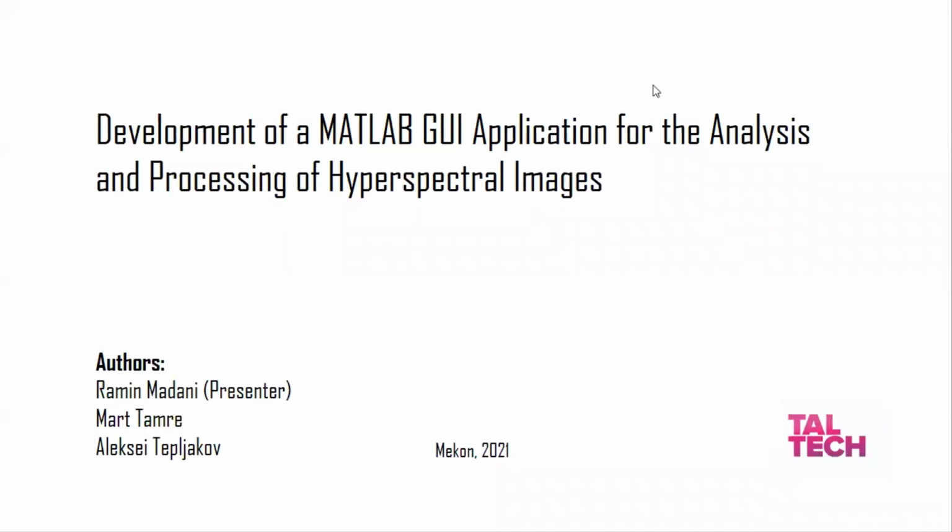Hello everyone, this is Ramin Madani presenting our MATLAB GUI application, which is dedicated to the analysis and processing of hyperspectral images. Our group consists of Dr. Mart, Dr. Aleksei Tepljakov, and myself. We're all from Tallinn University of Technology, or Taltech.